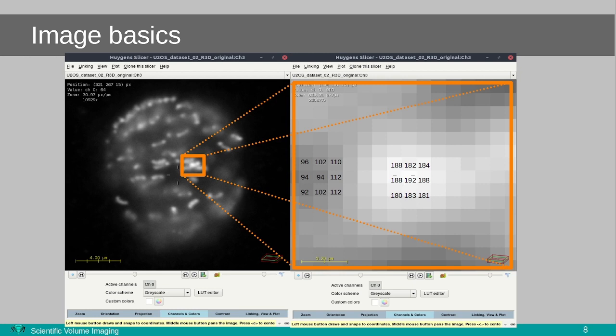The dynamic range is limited by your camera or detector. However, modern cameras often have a larger dynamic range, allowing for values well above 255. But in this example, we have 255. File formats also need to be able to handle larger values than 255 as well, and we'll return to this later.